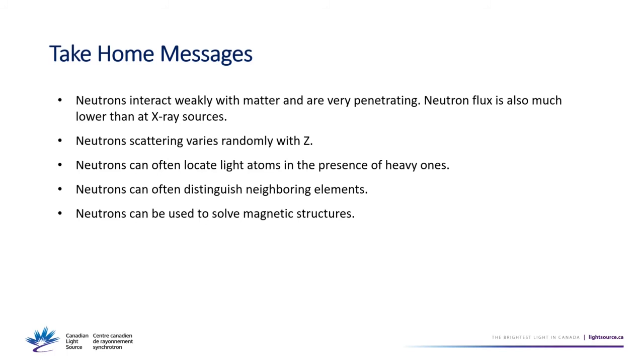Programs like GSAS and others are set up to do that. I think the original GSAS was made specifically for that purpose. Is that right? Yeah. And so you can add other data sets in. You could refine against 4 neutron diffraction banks and a synchrotron powder diffraction data set all at the same time. So it's adjusting the variables to fit all the data sets at the same time. And when you do that, you have to think a little bit about how you're weighting the data sets. But you do all of them simultaneously, so it's a single refinement.